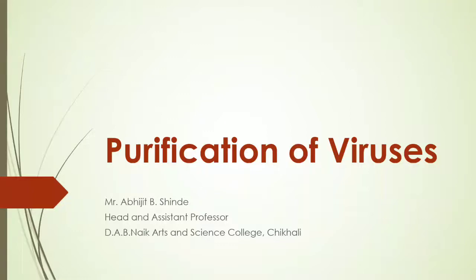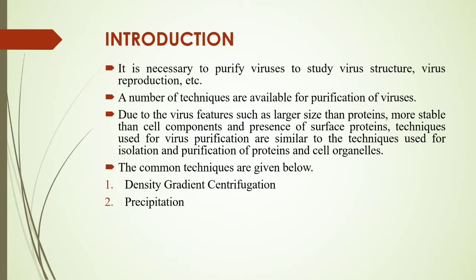Hello everyone, in this lecture we are going to study purification of viruses. It is necessary to purify viruses to study virus structure, virus reproduction, etc. A number of techniques are available for purification of viruses.